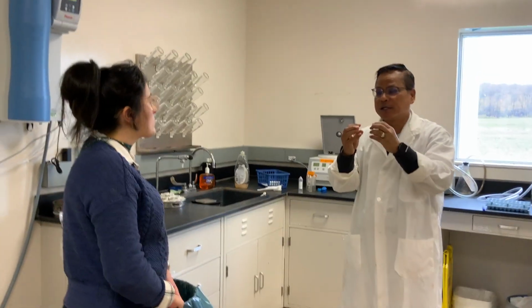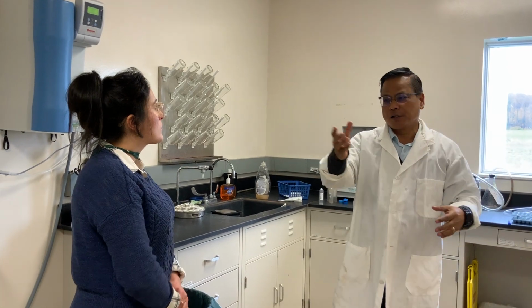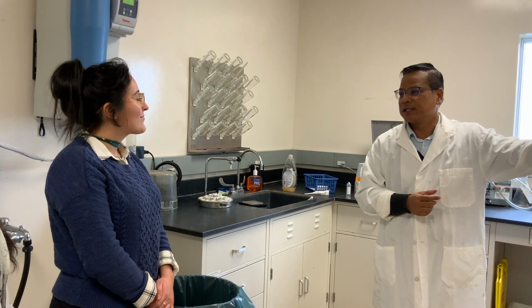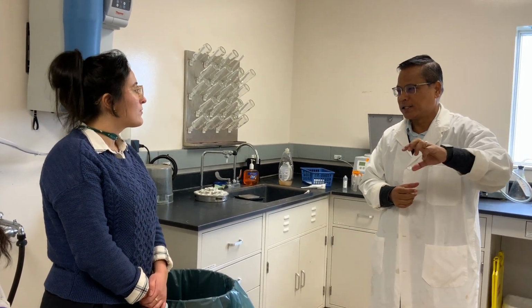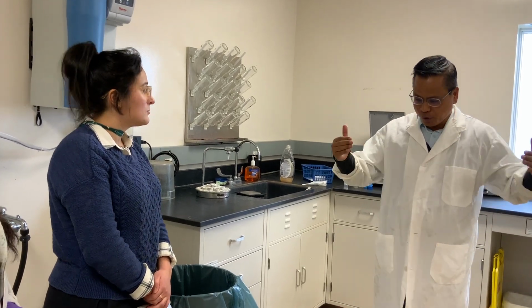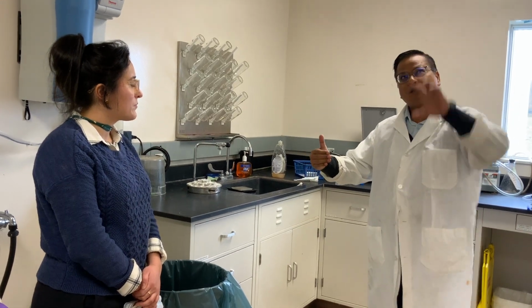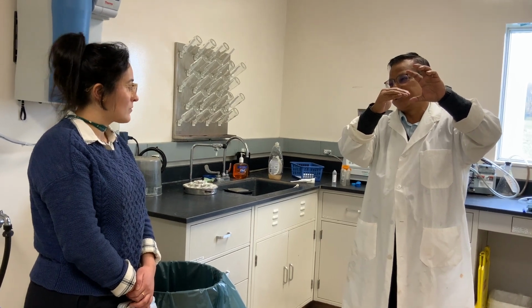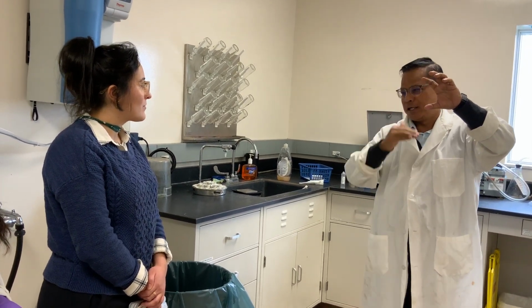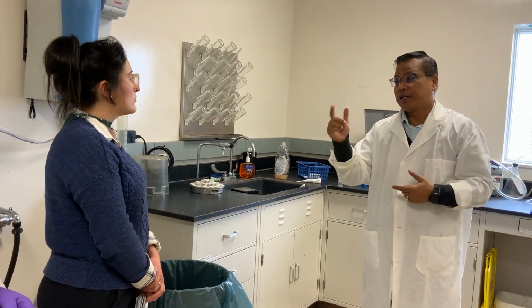We will establish your gravimetric analysis result with a spectral character, because Dr. Suzy and Professor Kathmandu are working on getting the spectral signature of this wastewater that has a certain amount of TS or TSS that you have measured. So we correlate that, and later on we put in water and try to see where exactly it matches, and try to see, okay, this has this much TSS, this has this much TSS. So we'll rate the water based on the spectral signature that we get.